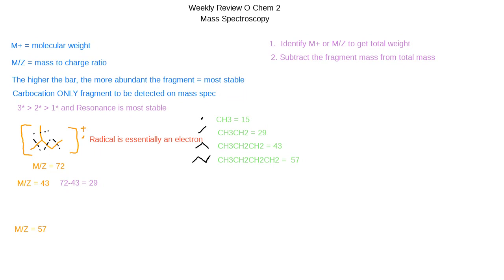And that will be where we cut, but it's asking for the remaining structure. So don't get that mixed up, and I'll draw both of them so you guys can understand the difference, okay? So that's what we're left with, and because I cleaved that bond, it gains a positive charge because carbon no longer fills its valence electrons.